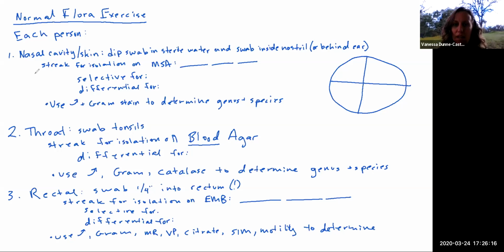For the technique behind the streaking here, you would have taken that swab, and in quadrant 1 with that rolling swab technique, you inoculate that first quadrant. Switch to your inoculating loop. For the rest of these 3 would be loop, and this first one would be swab. Then proceed with a streak for isolation here. Resterilize, resterilize. And you are looking for individual colonies somewhere out here or out here.